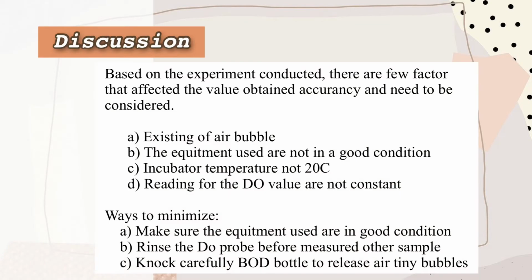Based on the experiment conducted, these are a few factors that affect the accuracy of the value obtained, and this is a way to minimize them.